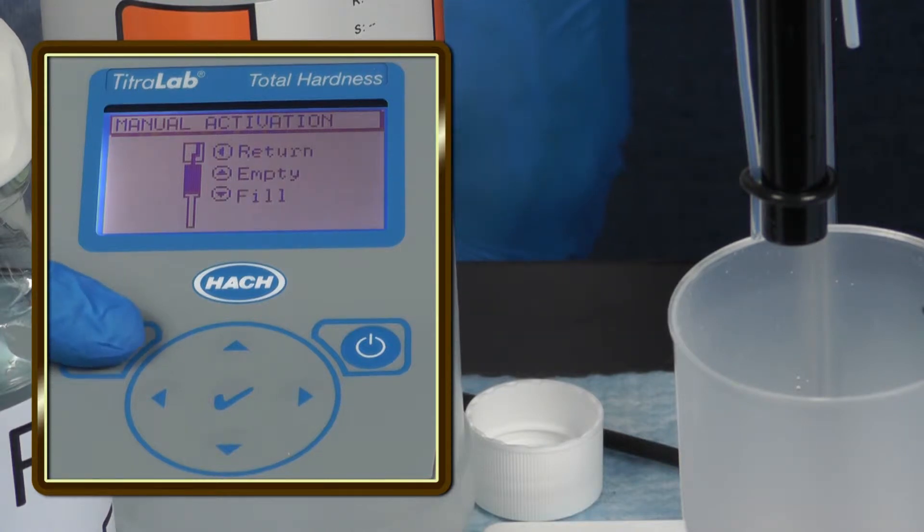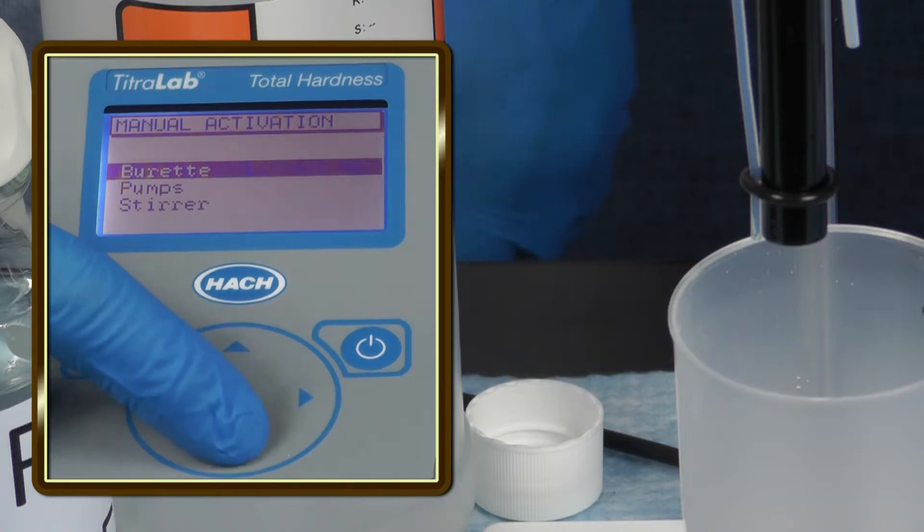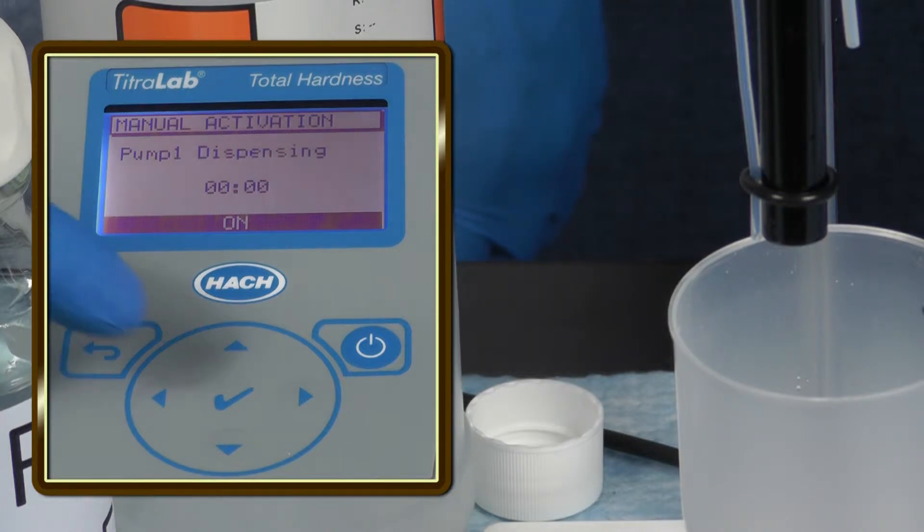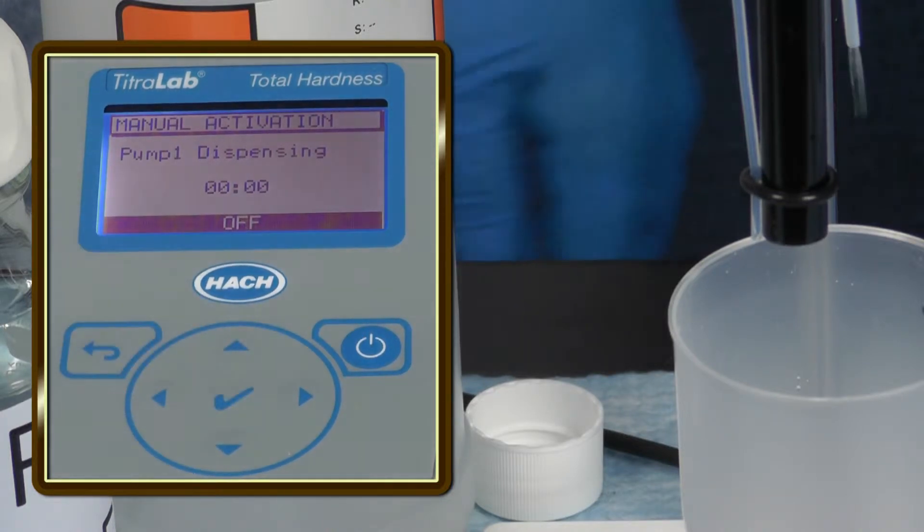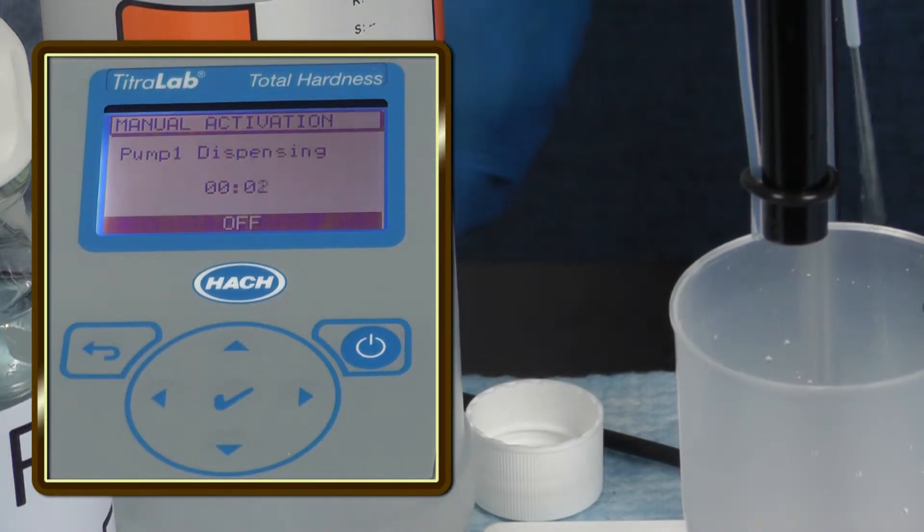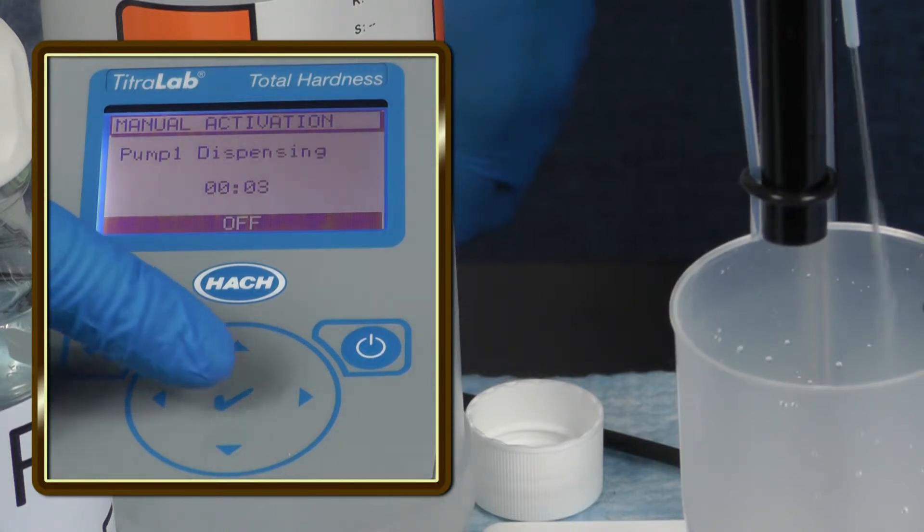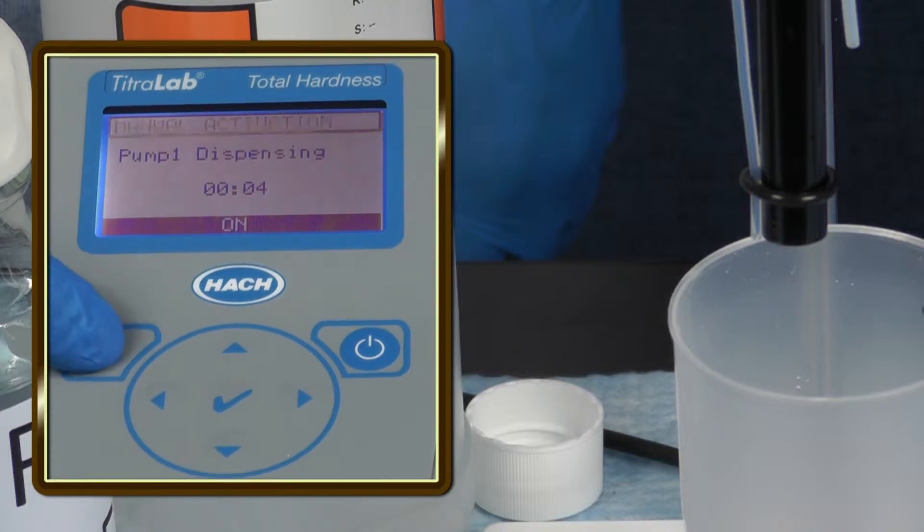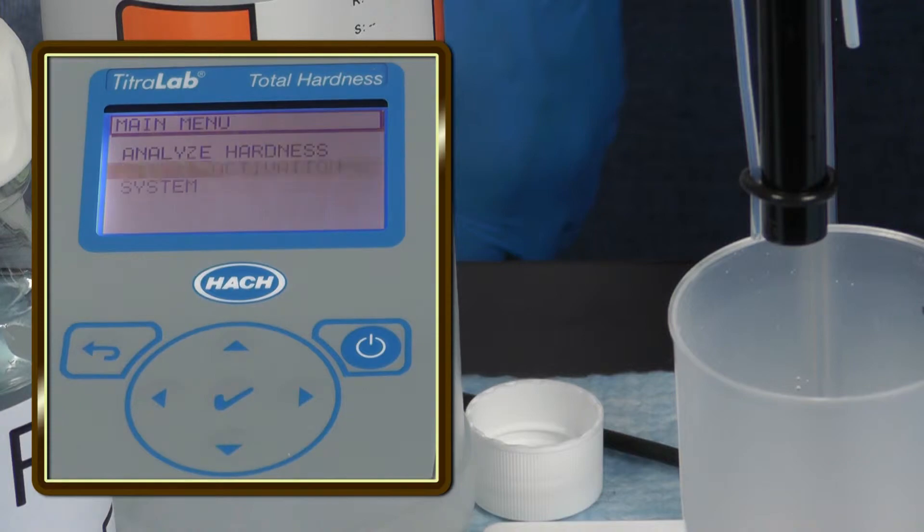Press the pump to prime the pump for the tris buffer on the keypad. Scroll to pumps. Make sure there is a waste beaker under the electrode. Press the check button and let the pump run for four to eight seconds and press the check key again to turn off the pump. Press the return button twice to return to the main menu.